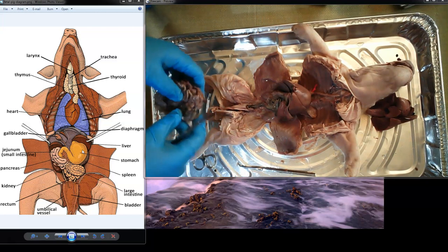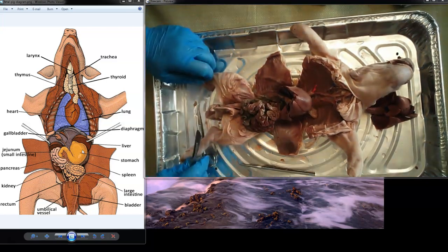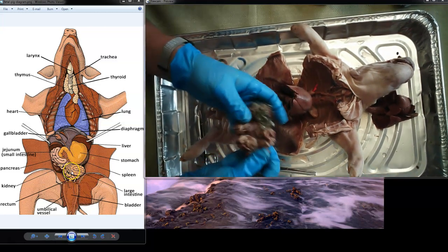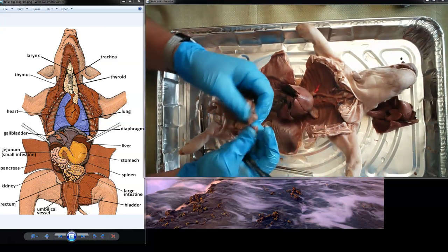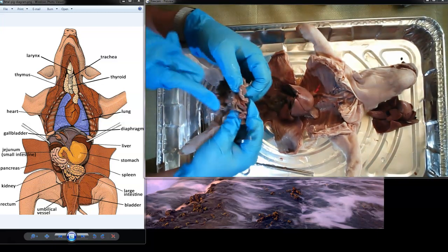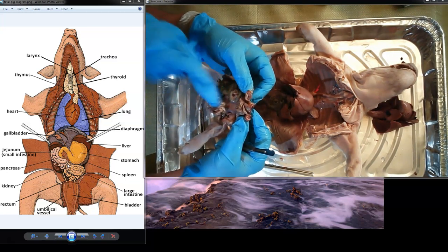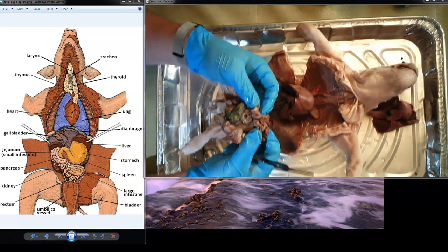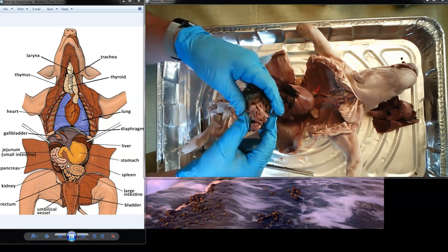Okay, questions. We have some questions, I'm sure. No? Yeah, what's your question? Could we touch it? Sure. All right. So here we go. You can put your hand in and touch it. You can squeeze it between your fingers. It feels slimy? Yeah, I mean it's wet. It's not really slimy. I thought this was the brain. It is not the brain. It kind of looks like a brain when it's all squished together, but it is not the brain.